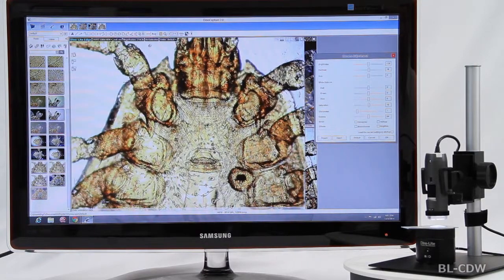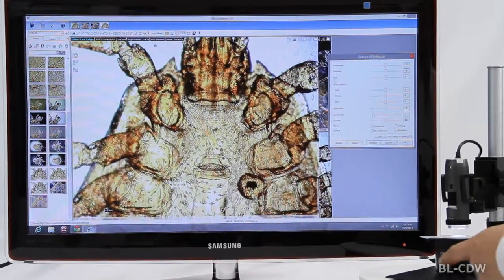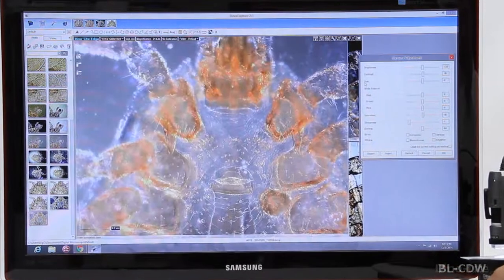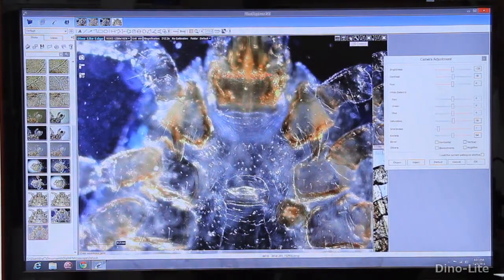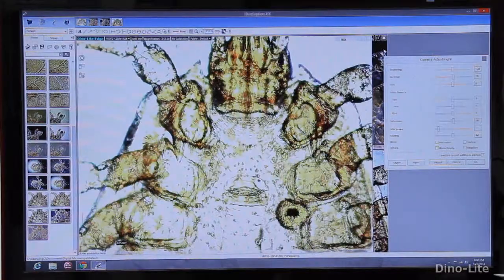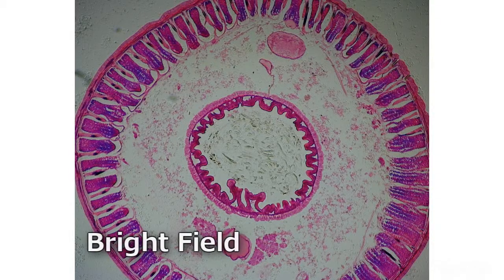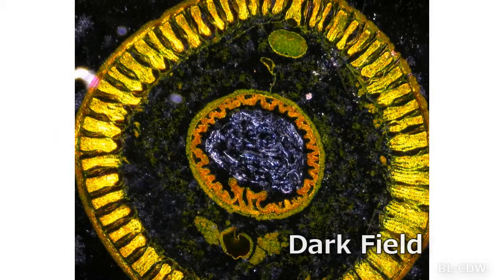By switching to dark field mode with a simple touch, the BLCDW generates a hollow cone of high intensity light to form dark field illumination. This oblique illumination may reveal more surface details that are not easily or well seen under bright field illumination.